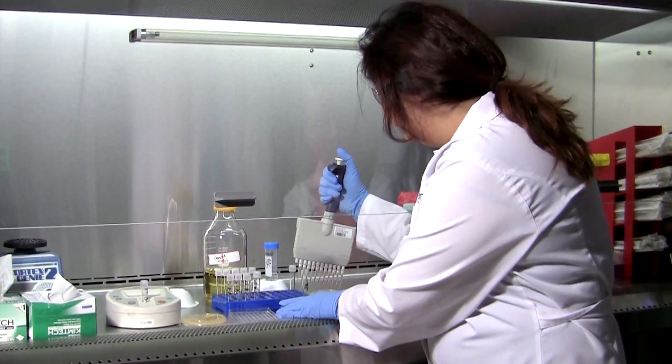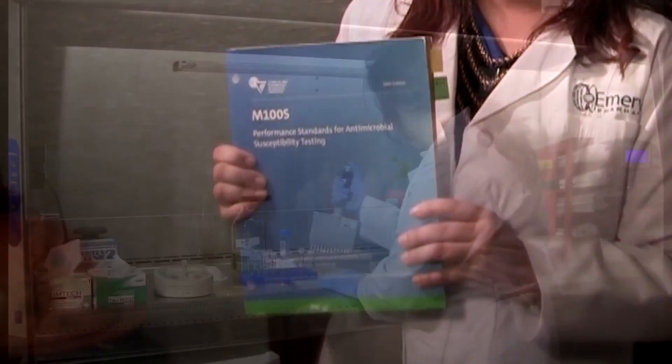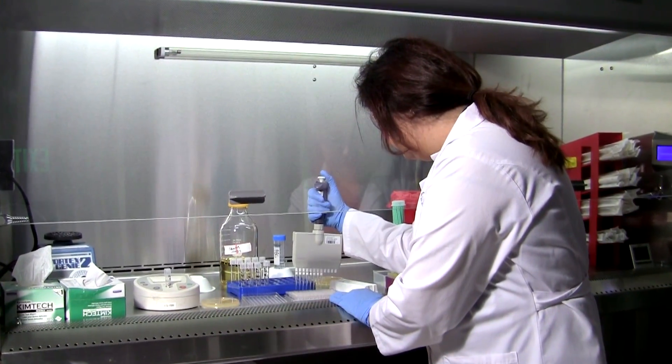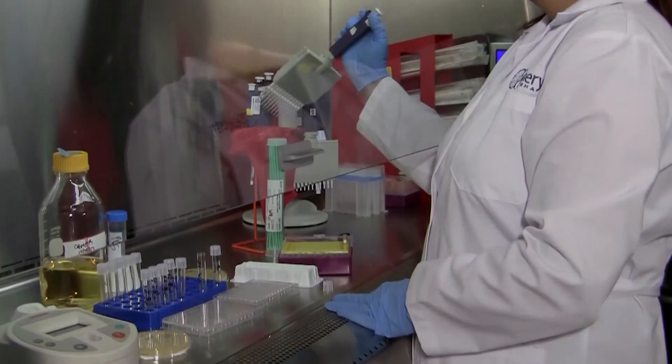Today, we're going to speak about the minimum inhibitory concentration test or the MIC test. Here at Emory Pharma, we carry out MIC testing as per CLSI guidelines and this is a quick method and also a well-approved method by most regulatory agencies.